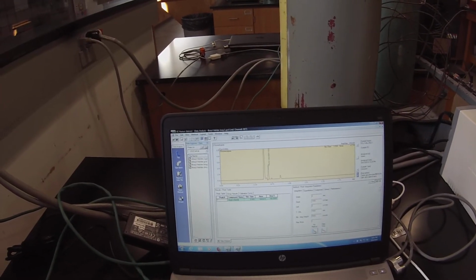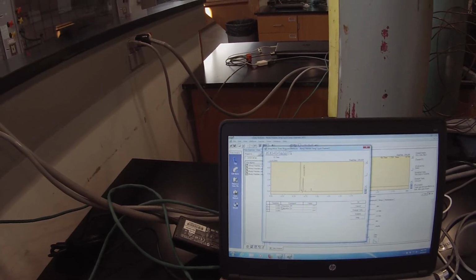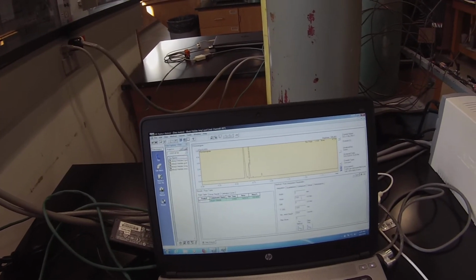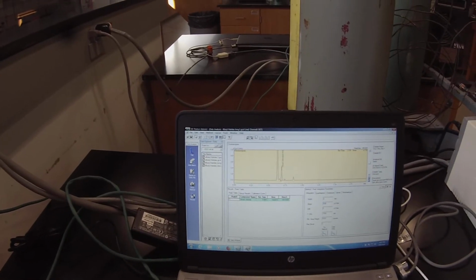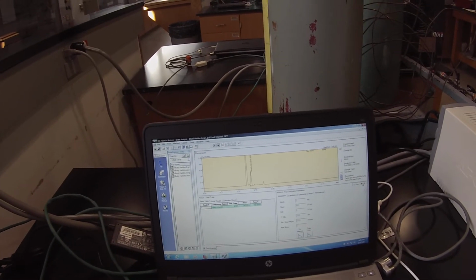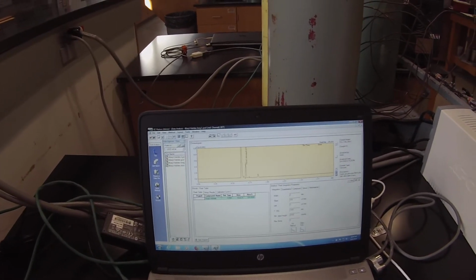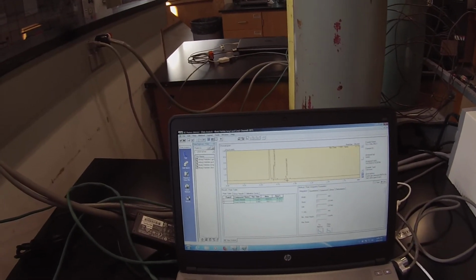So I'm going to edit for method. 0.65, that seems reasonable because it's coming off 0.693, but I probably have to change either the width or the minimum area or the slope. I'll try changing that slope to 500, see if that makes that peak show up, and it didn't. I'll try lowering this to 2,000 for the minimum area. And that did it. Now it's showing up.